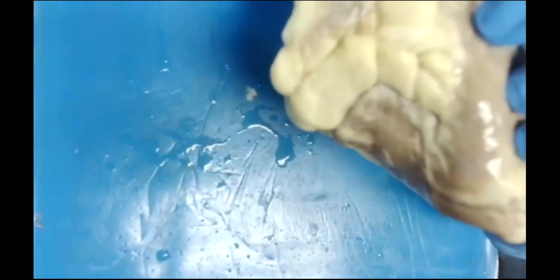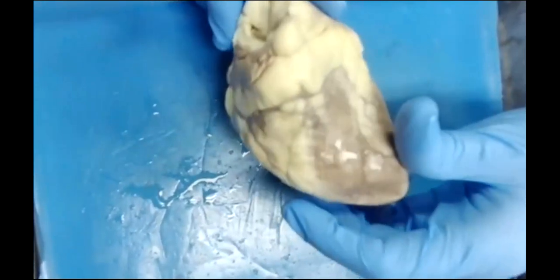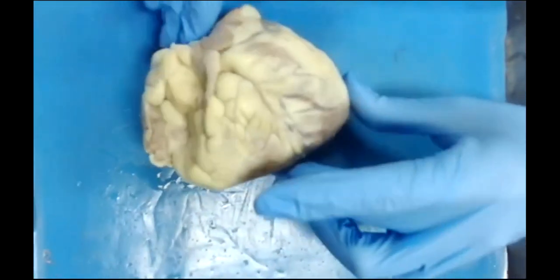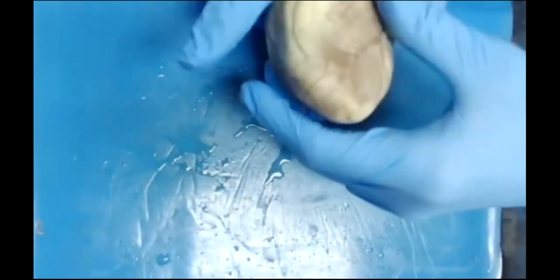Okay, now first off, we can notice that it is covered in a whole bunch of fat. This fat is important as cushioning while also being a bit of a nutrient reserve for the heart itself. Now we do have some empty spaces here in between the fat. These are basically places that are subject to friction, whether between the sternum or the diaphragm or something like that.